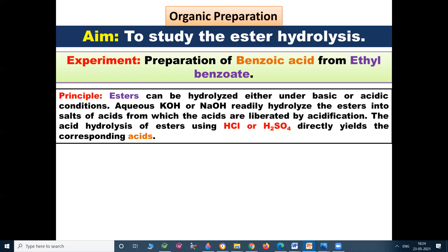The acid hydrolysis of ester using HCl (hydrochloric acid) or H2SO4 (sulfuric acid) directly yields the corresponding acids.